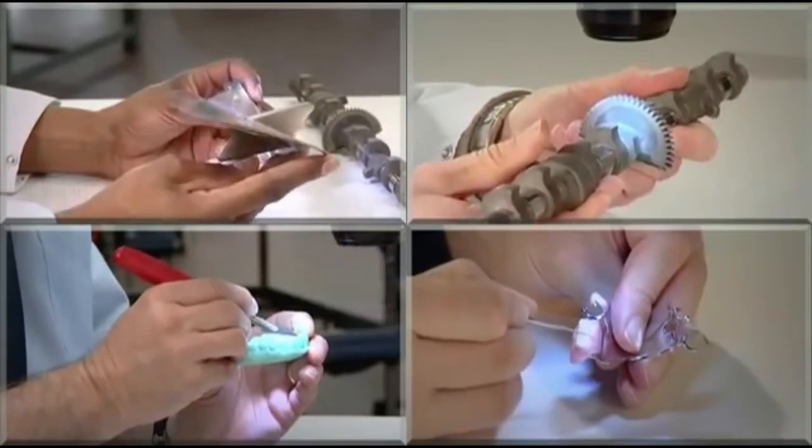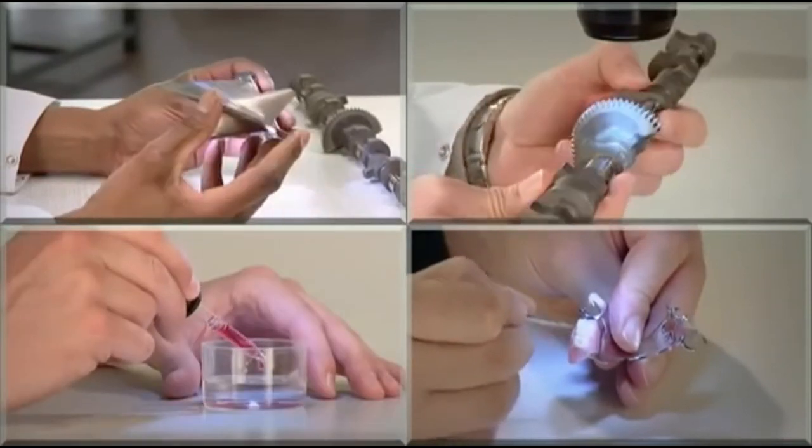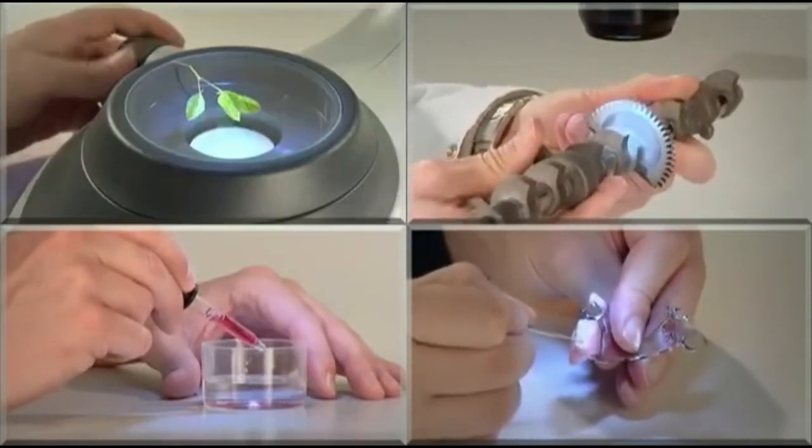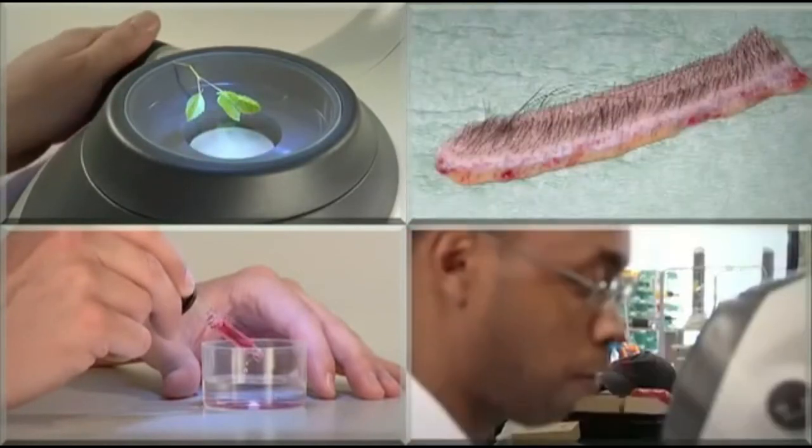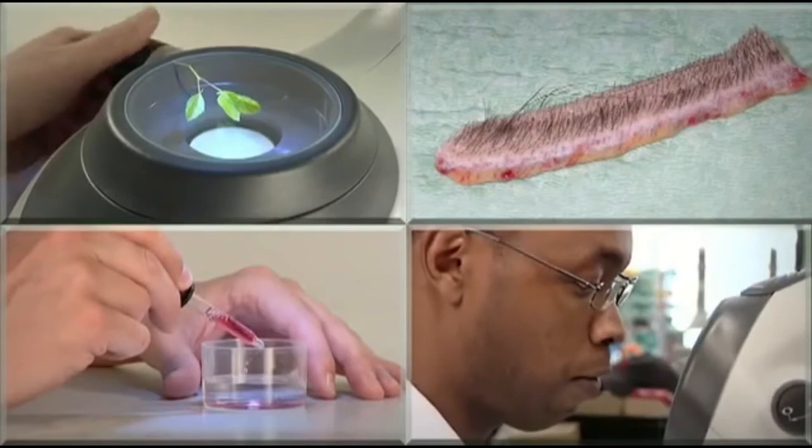Applications also include dental laboratory manufacturing of teeth, implants and bridges, biomedical laboratories, horticultural work in agriculture, jewellery and restoration, and hair transplants.